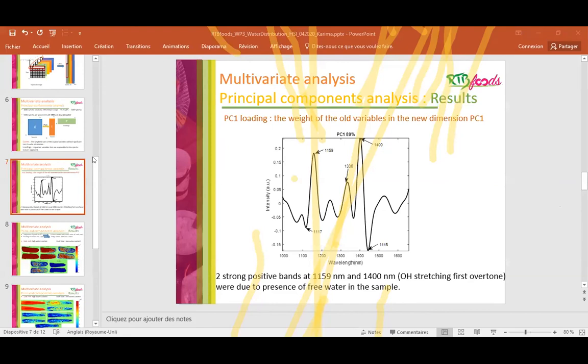Yes, yes. In another food, many components are characterized by HSI. You know, this is just the first test on RTB products. We can test other things and see. We can characterize another component on RTB crops and products.